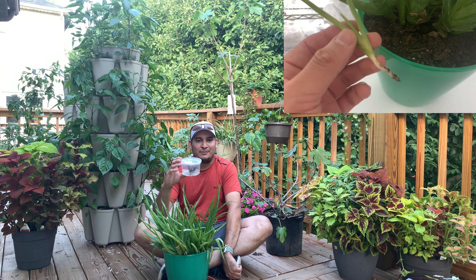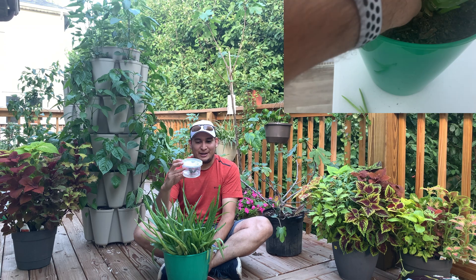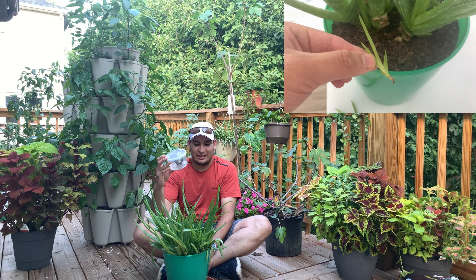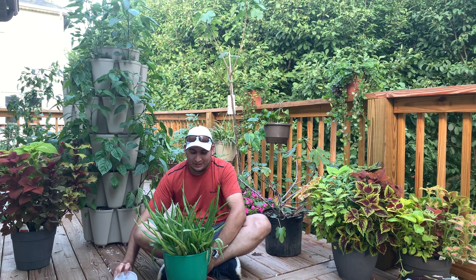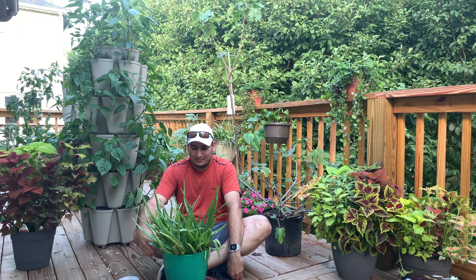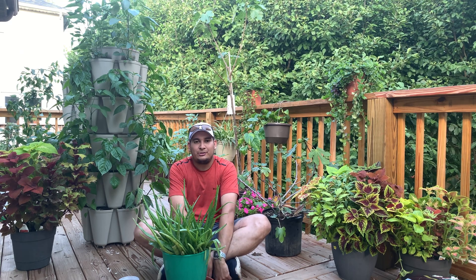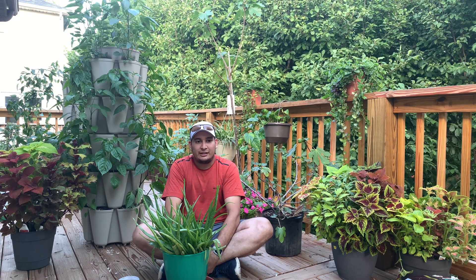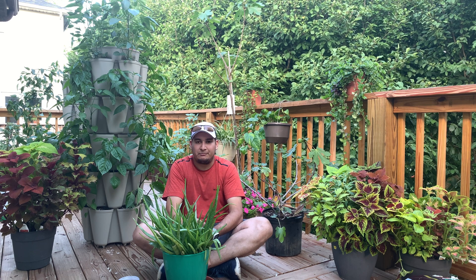So I'm very happy. Aloe vera may not be a great plant to propagate in tissue culture commercially, but I think it's a great plant to practice tissue culture on. It's actually a quite fast-growing plant and it does very well outside. So if you have an aloe vera plant, I would recommend giving it a try — try to sterilize it and put it in tissue culture. It's great for practice and it is a very inexpensive plant that's relatively easy to introduce to tissue culture.